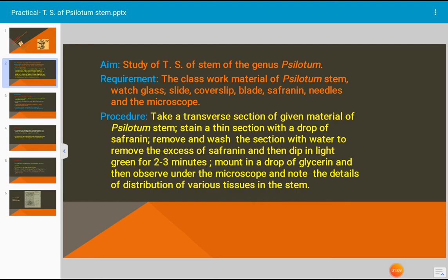Then again remove from the light green and mount in a drop of glycerin. This is a temporary slide preparation. Stain is used to differentiate the cells which are present inside the stem. We have to observe this temporary slide under the microscope and write down all the details about the distribution of tissue inside the stem of Psilotum.